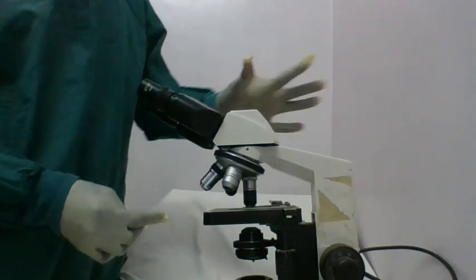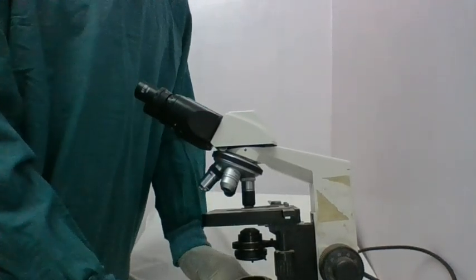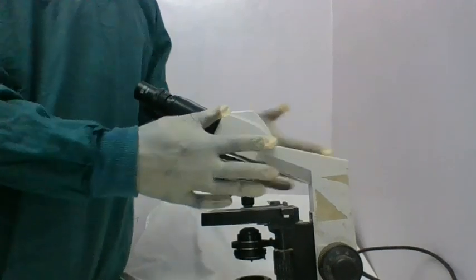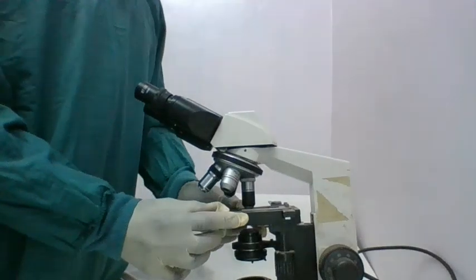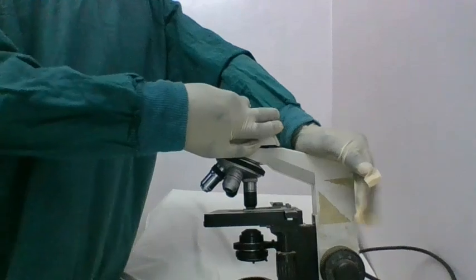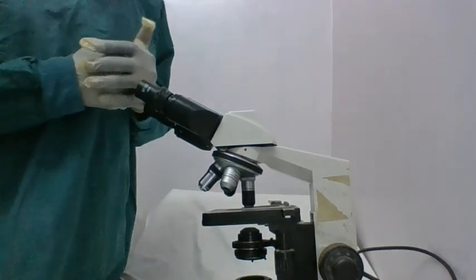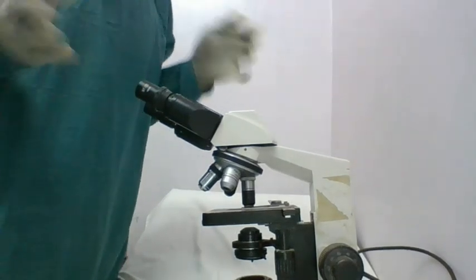Guys, is there any part of the microscope that you feel we need to touch on that we have not touched in this episode? Because in the next session, I want to do a thorough examination. How do you find a fault diagnosis on a microscope? How do you rectify errors on your microscope? How do you maintain your microscope? How do you get proper readings on your microscope? How do you make sure that you're giving better results, not forged or cooked results, or just results that you're assuming?